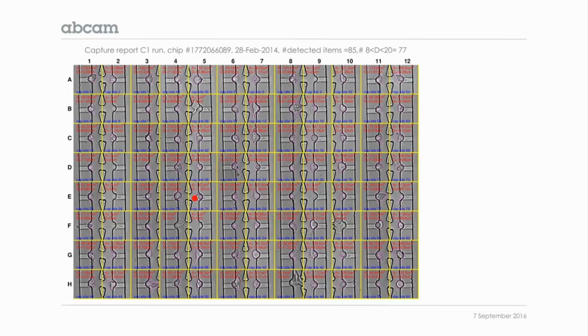I could add perhaps that before this isolation step, there is also the extraction step. This is one of the key things in single-cell RNA sequencing, because it will affect which cells you have represented when you are doing the analysis.